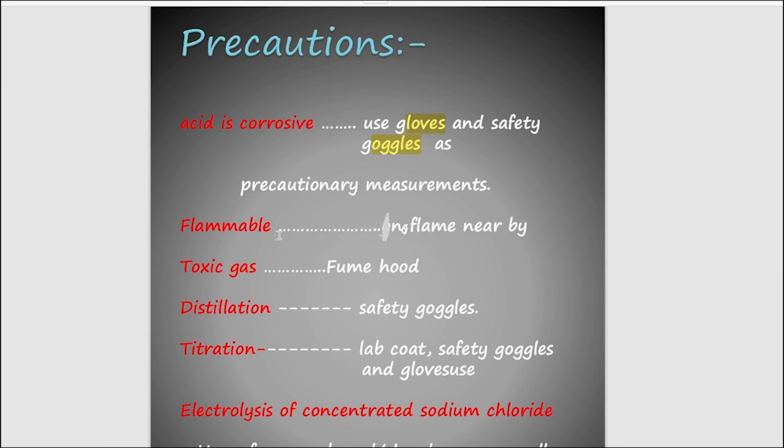If flammable substance is there, always remember no flame should be nearby. Fume hood is used for the toxic gas. For distillation process, safety goggles. For titration, you should wear lab coat, safety goggles, and gloves. These gloves will be used for the titration process.